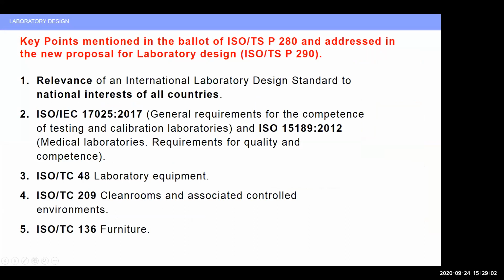I told you that during the first ballot, we received several comments from several countries concerning potential overlap with other committees, and also major, very fruitful comments. The first one being the relevance of an international laboratory design standard to national interests of all countries. Other comments concerned the link with ISO IEC 17025 about competence of testing and calibration laboratories, and ISO 15189 being dedicated to medical laboratories. Then the link with ISO TC 48, the one with ISO TC 209 and the one with ISO TC 136. I will show you in the next slide the way we see the collaboration between those committees.